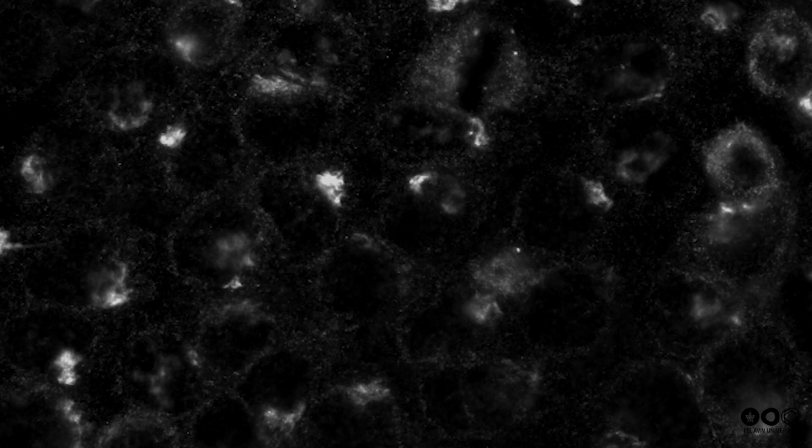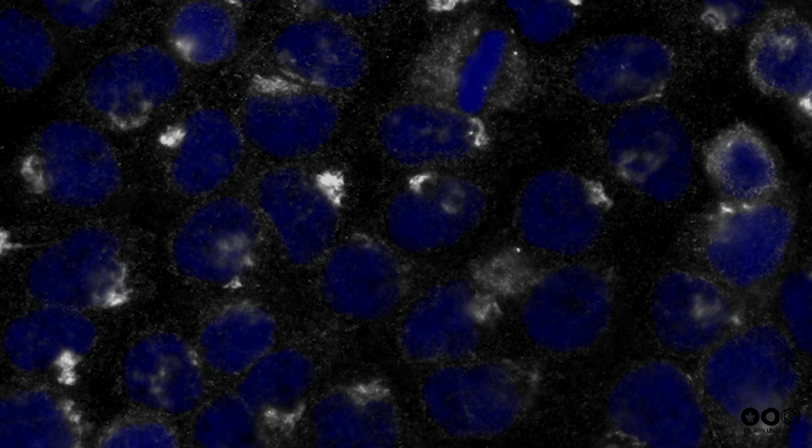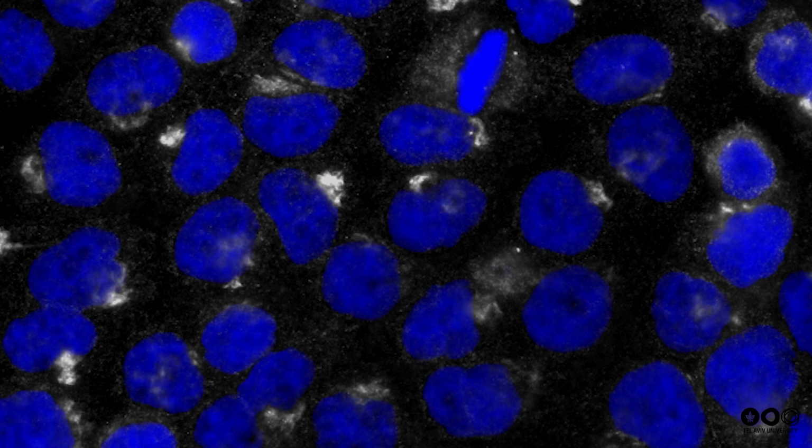plastic did not. If we want to stain the nucleus, for example, we might want to use a chemical or a reagent that specifically binds DNA. And if this stain has a fluorescent blue color, then all the nuclei of the cells will stain fluorescently blue. Thus, for each organelle, scientists have developed colored dyes that selectively bind to that organelle and stain it, revealing its shape, size, and position within the cell.